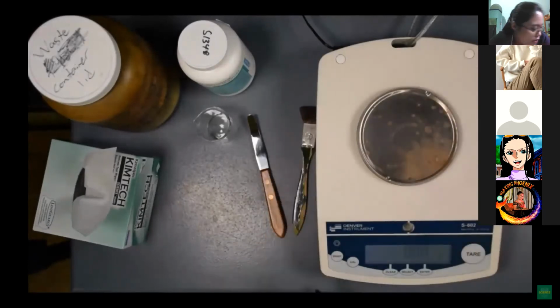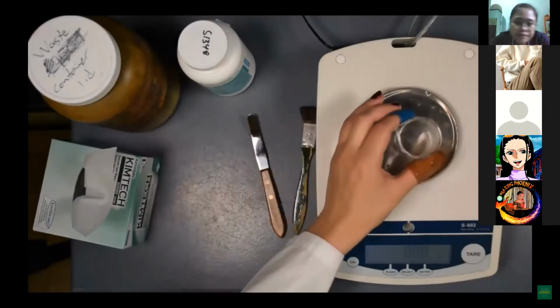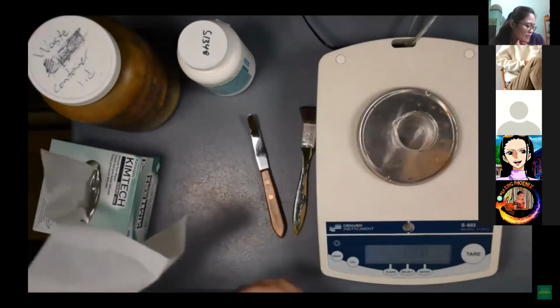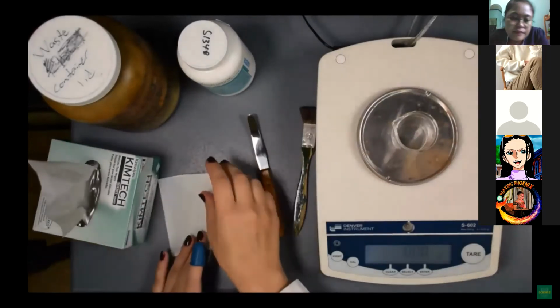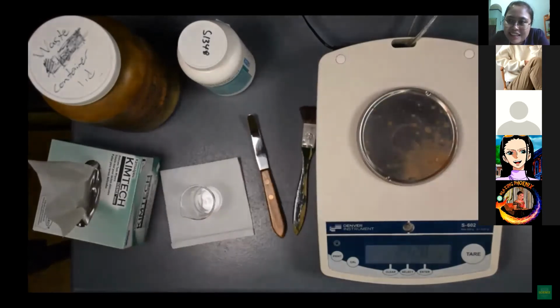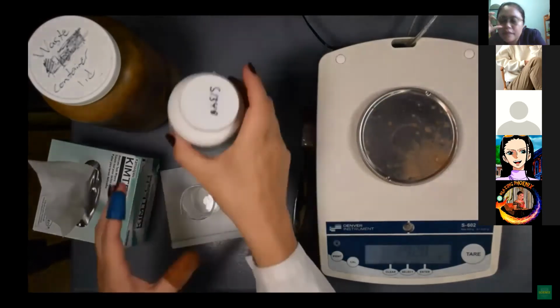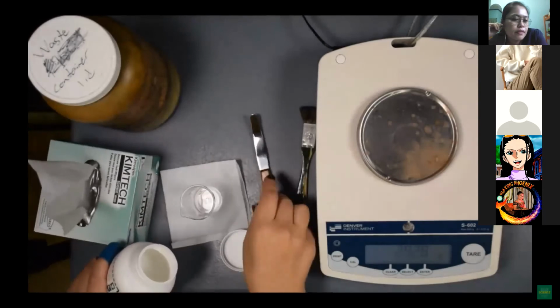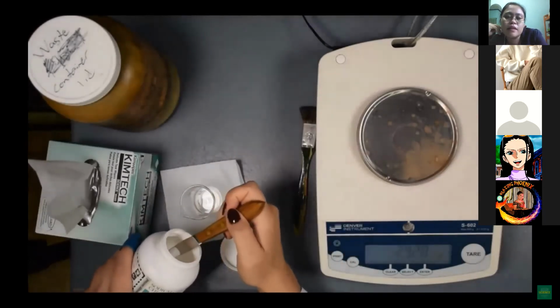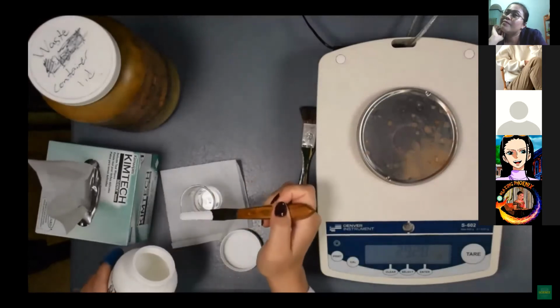Place the beaker on the top loading balance. Tare the top loading balance with the beaker on it. Chemicals should never be weighed directly on a balance. Remove the beaker from the balance. If the bench is dirty, it is a good idea to place the beaker on a Kim wipe to prevent particles from adhering to the outside of the beaker and increasing its mass.